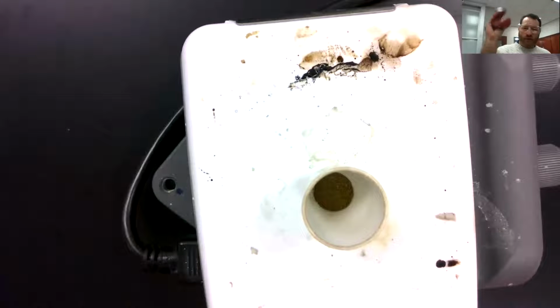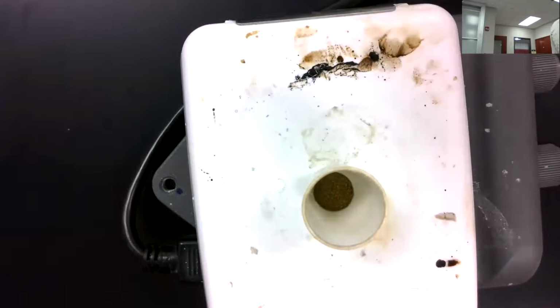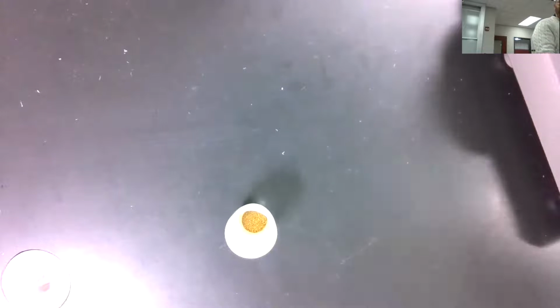And so now, carefully using hot hands, I'm going to remove it. I'm just going to set it down on the black tabletop here to cool for a few minutes. These black tabletops are impervious to heat, so it's a very safe place for it to be, just there on the countertop. Again, I'm going to wait about 2 or 3 minutes and let it cool off before we find the mass of it again. So I'm going to put you guys back on pause. I think that seemed to work pretty well last time. I'll see you guys in about 2 or 3 minutes.